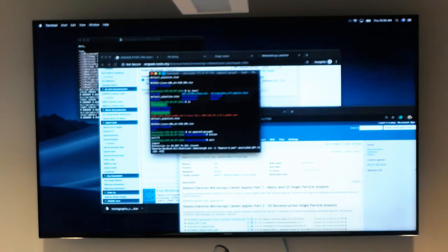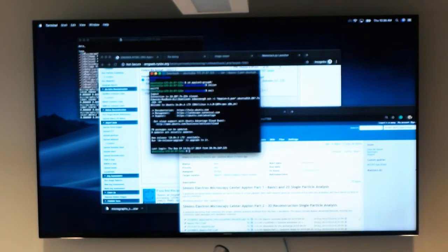So it's ssh -i, quotes, Appion-2.pem, ubuntu@your IP, -XY. So that's for the X display. Then we'll just give you a second. Hopefully everyone has oriented themselves. If you don't know your IP, Swapno's coming around right now to orient you. So then if you hit enter, you'll hop into here.